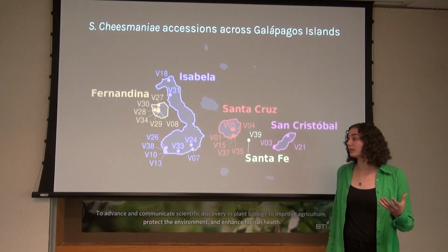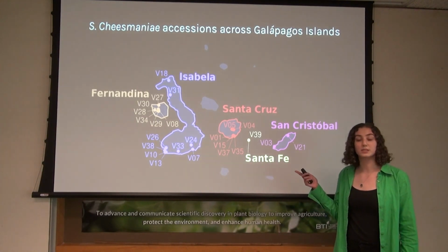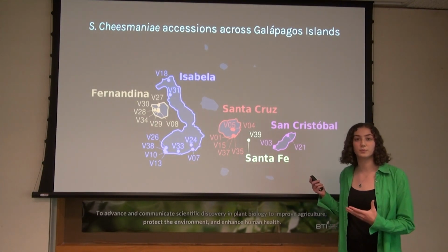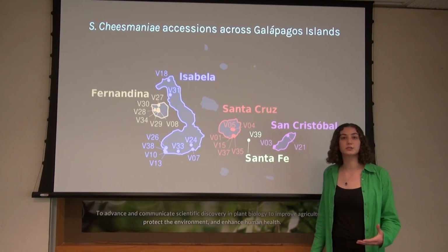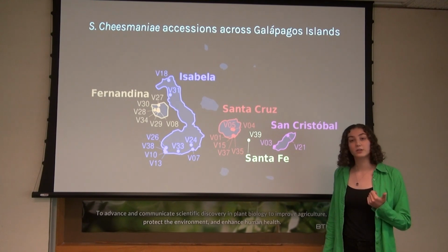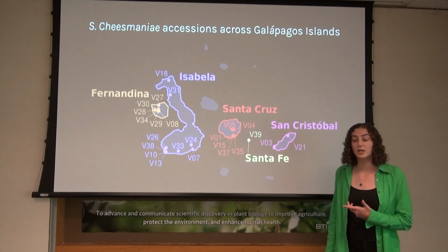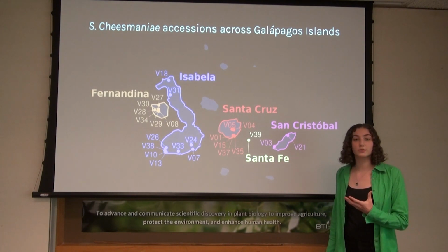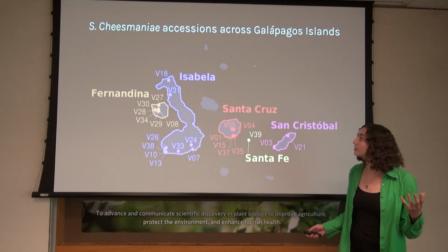and when we're identifying patterns in the phenotypes that we see, we're looking to match them to see if there are any trends from the different islands. And what we're doing with this project, our goal is to be able to phenotype these different tomatoes accurately and easily. So we're using a computer vision pipeline that we developed to take pictures of the fruit and make measurements based on the photos instead of having to do measurements by hand.